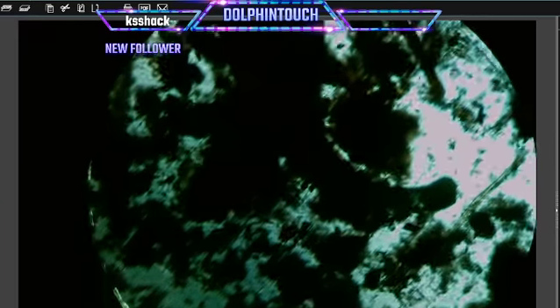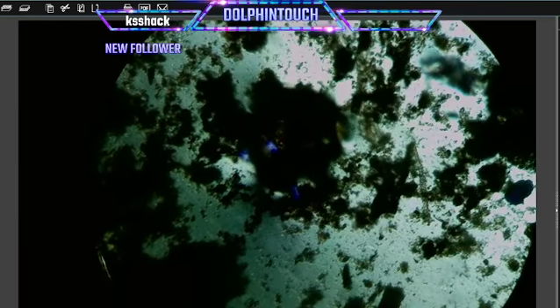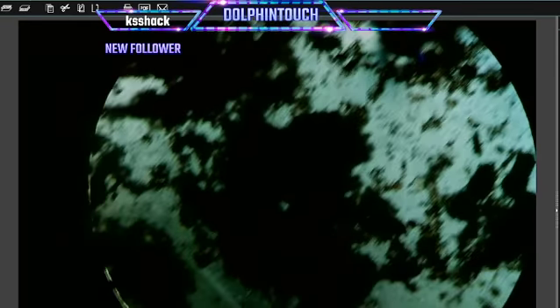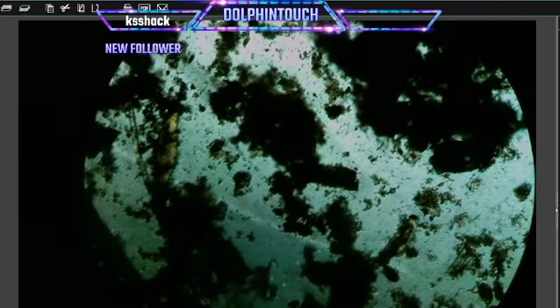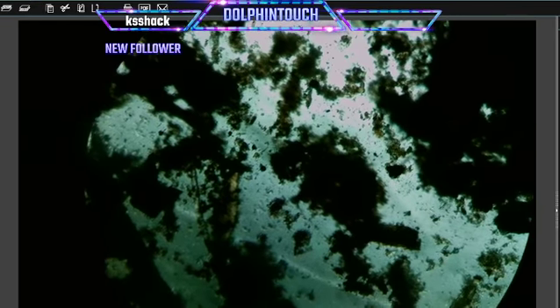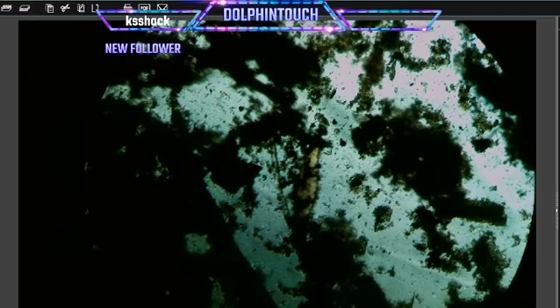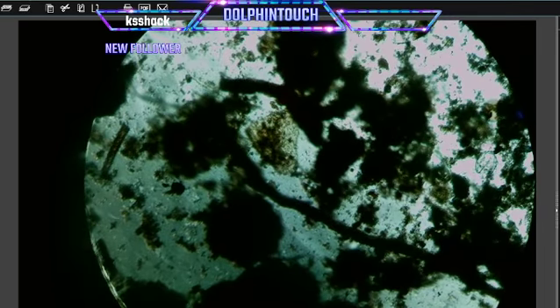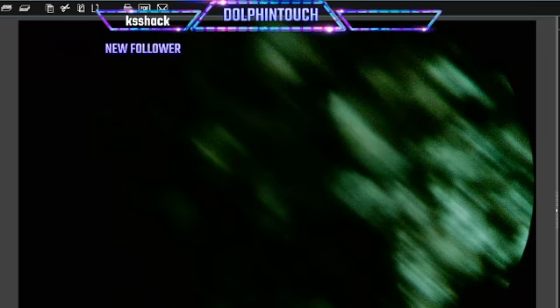Further up here, that seems to be hardly anything. Okay, we'll move over this way. And then I'll go to my deeper water and see what we can find there. The only thing with my deeper water is we've got a lot more algae and stuff. Doesn't seem to be much going on here at all. Rotifer, that's what we found before.